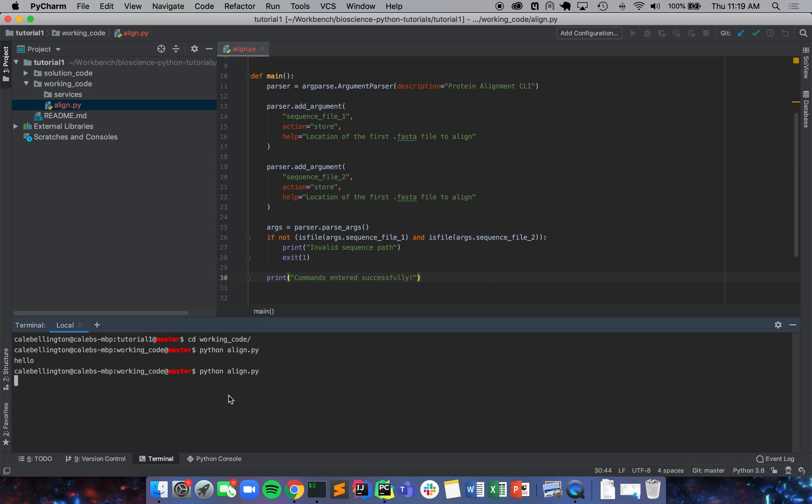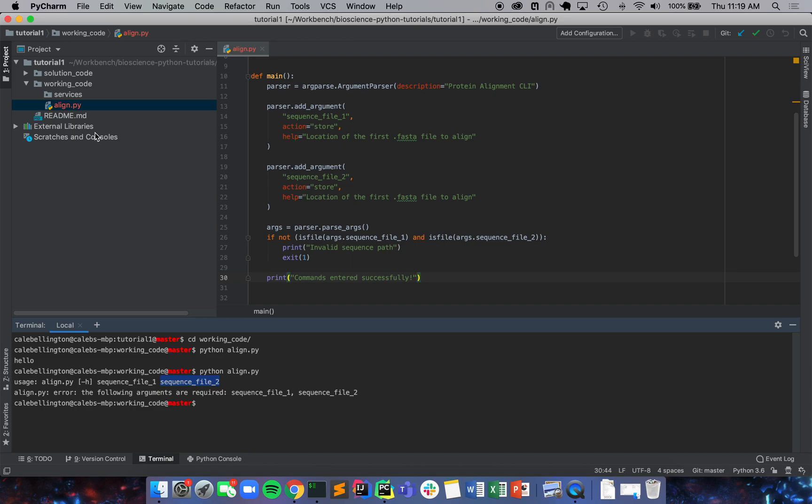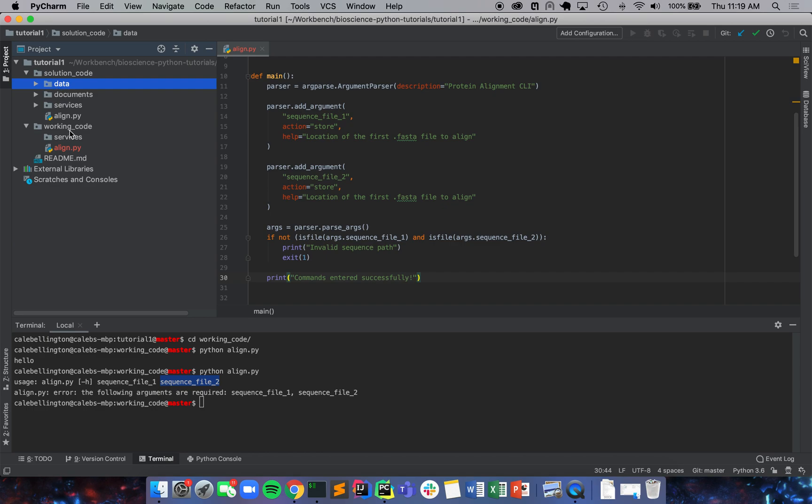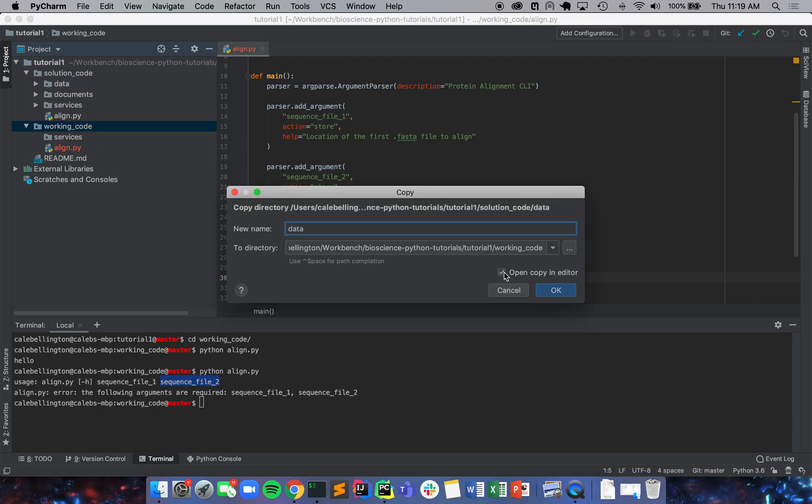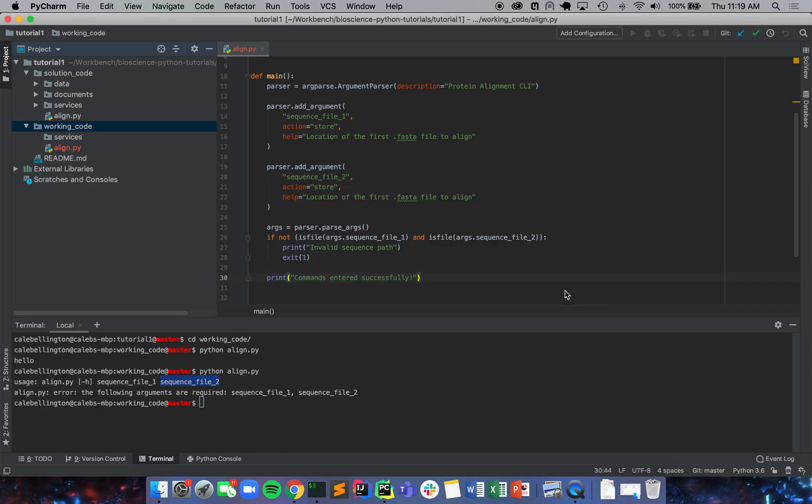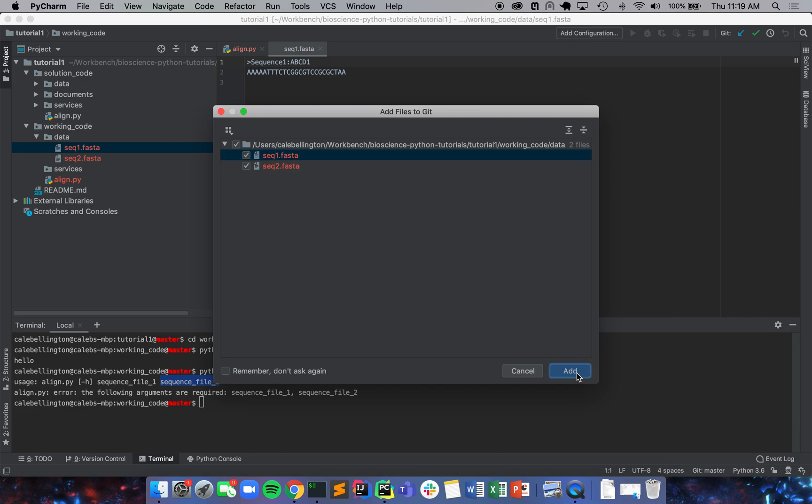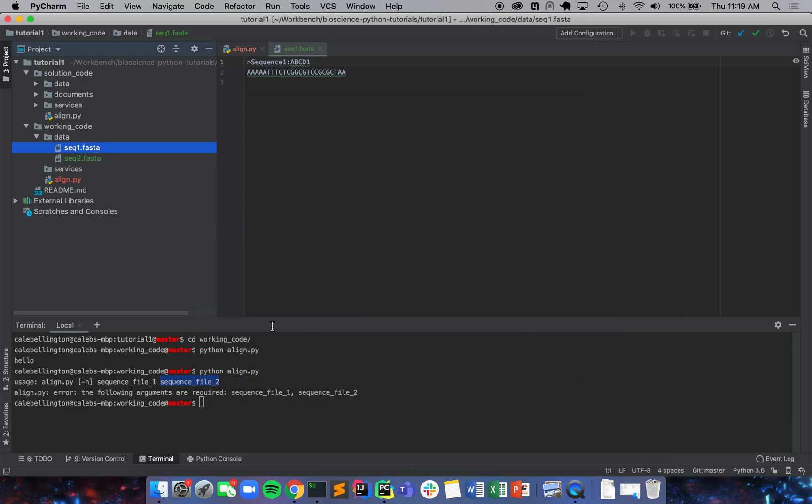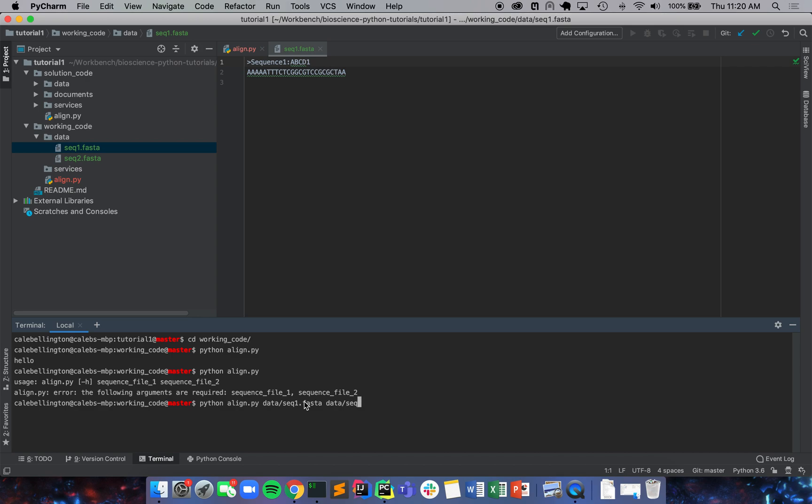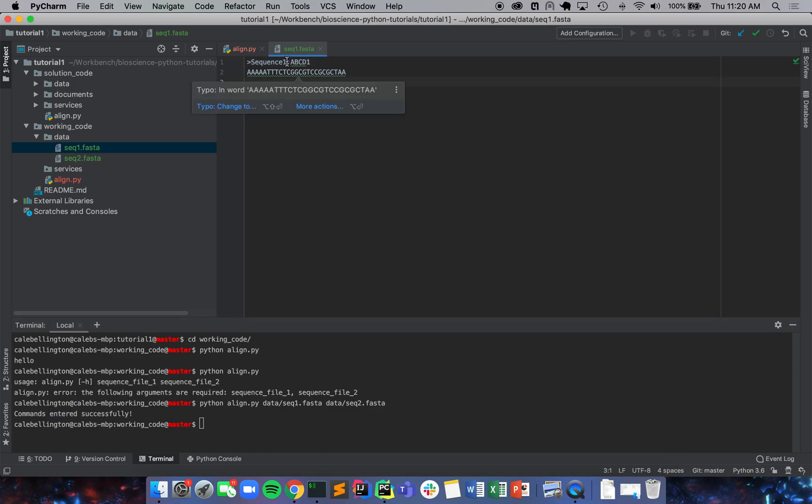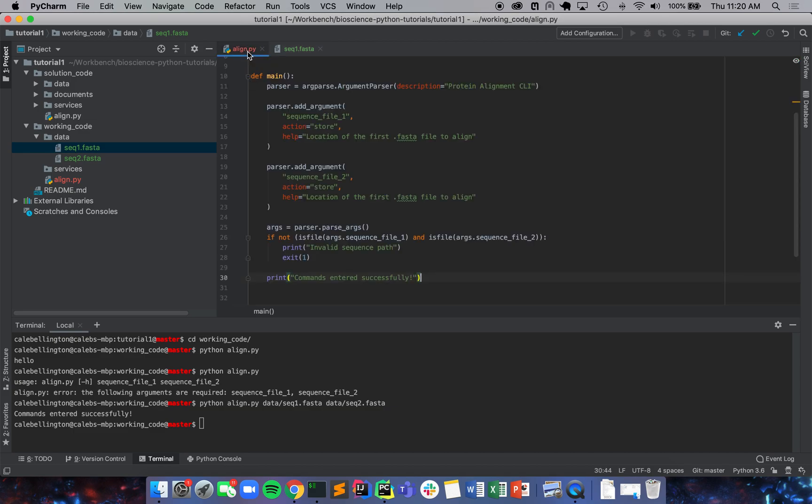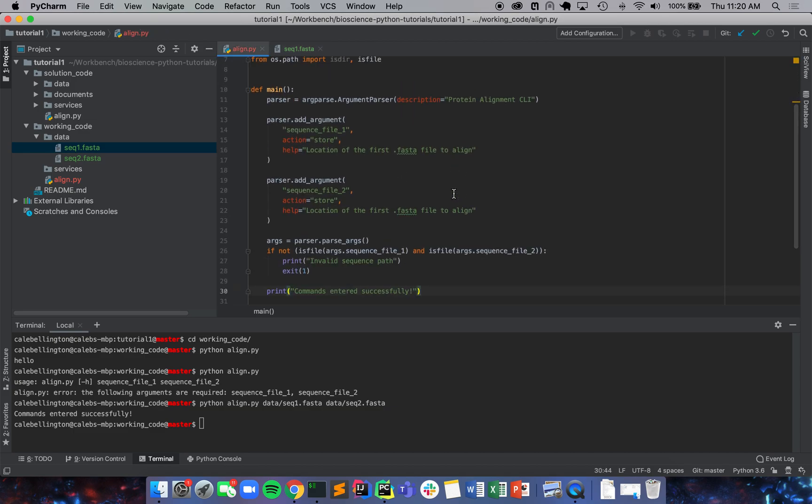So now we're going to run this again and it's going to give us an error because we don't have our sequence files here. So what I'm going to do is I'm actually going to do something a little bit lazy. I'm going to take the data from this directory and I'm just going to copy paste it into our working code. And we're going to take our seq one and seq two dot FASTA and we're going to say data/seq1.fasta and data/seq2.fasta. And it says commands entered successfully because we've entered two files. And this is our sequence one and it is a file and we have not given it the means to read this file yet, but it knows that we've given it a file.